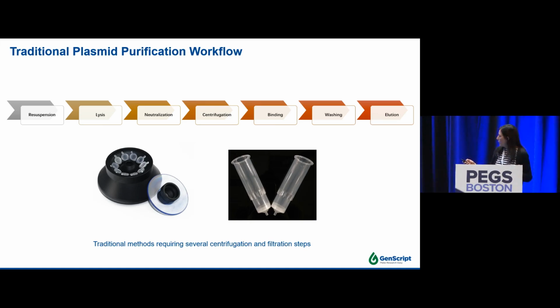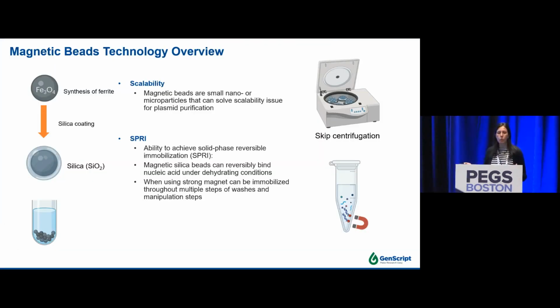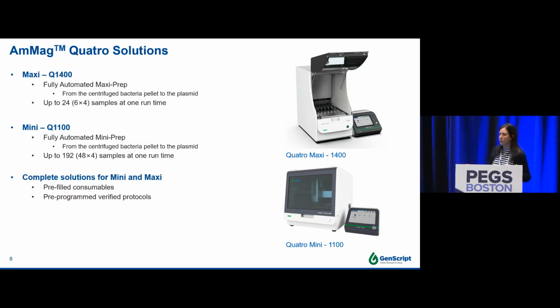So we thought about what would be a good solution to skip the centrifugation steps. We first thought that we know how to make beads. We know how to make magnetic beads very well, to coat the beads. And a very interesting characteristic of the beads is the ability to achieve solid phase reversible immobilization, the SPRI. And this feature of the beads would skip the centrifugation steps. So why not implement magnetic bead-based purification in our instrument? That's what we did, and we are going to show you the two instruments that use this technology.